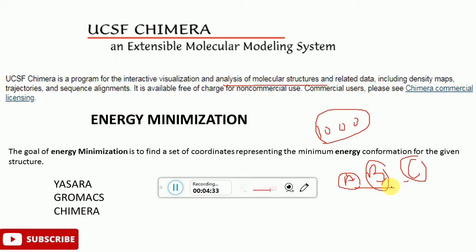Now this example is very small, so you can do it manually. But let's suppose there are 1000 amino acids in the protein, then it would be manually impossible to stipulate the spatial arrangement of all the 1000 amino acids with respect to each other. So with modeler, no doubt we are using a Python script to develop the protein model, but still the structure which is generated by modeler is a very rough structure. So we have to refine that structure in terms of energy balances.